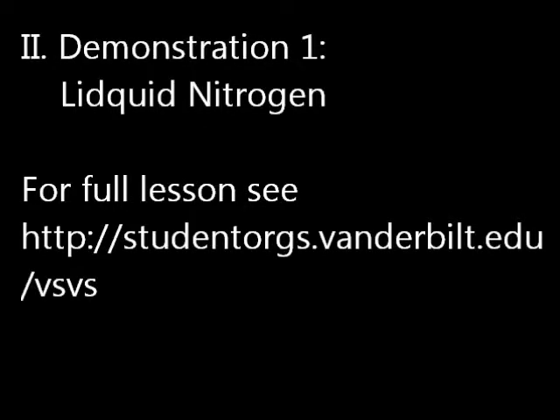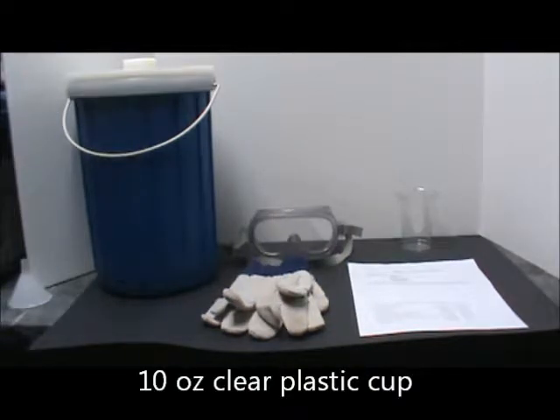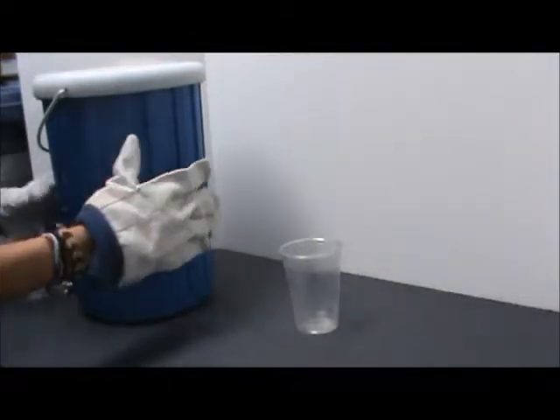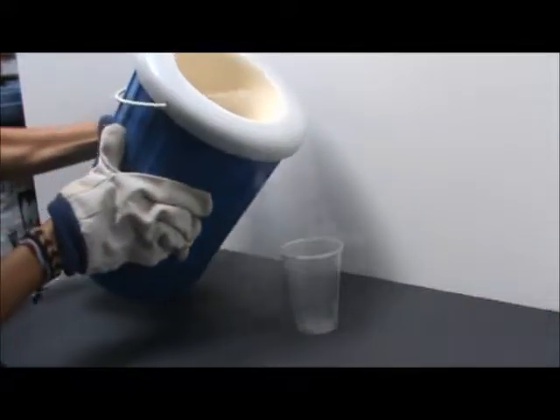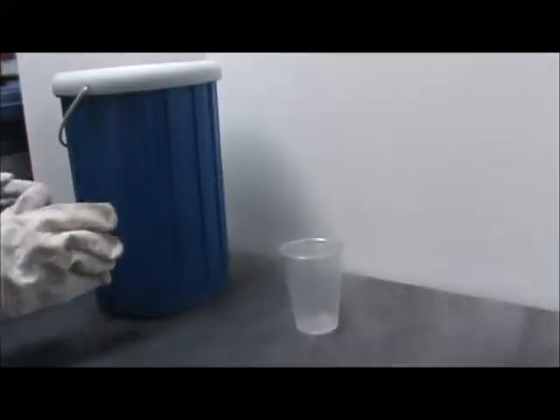Demonstration 1: Liquid nitrogen. For this demonstration you will need a large dewar of liquid nitrogen, gloves, goggles, a 10 ounce clear plastic cup, and observation sheets for each student. Pour a small amount of liquid nitrogen into the 10 ounce cup. Wear gloves and goggles when pouring. Have students draw their observations on the observation sheet.